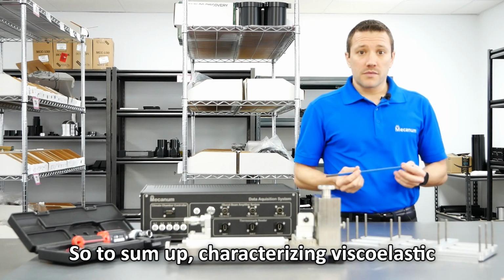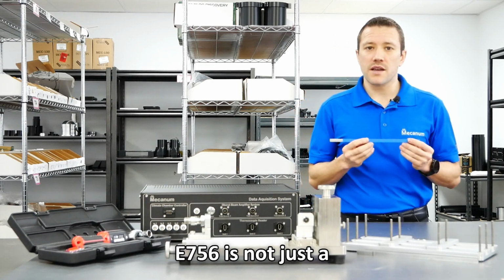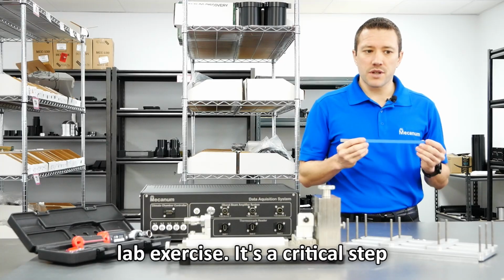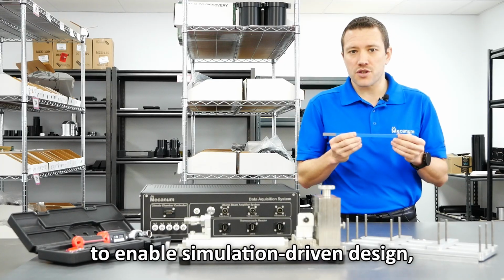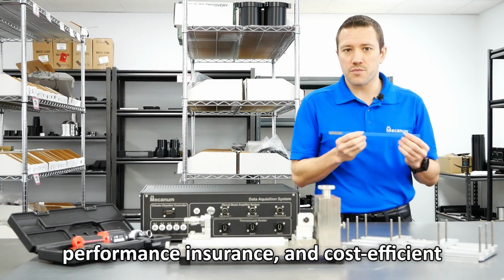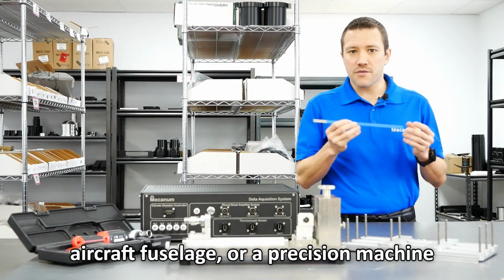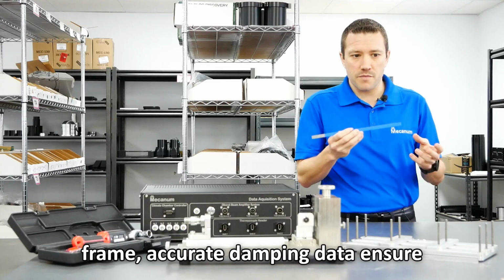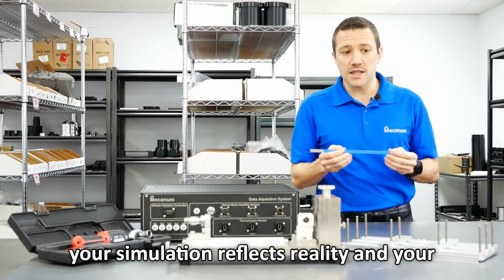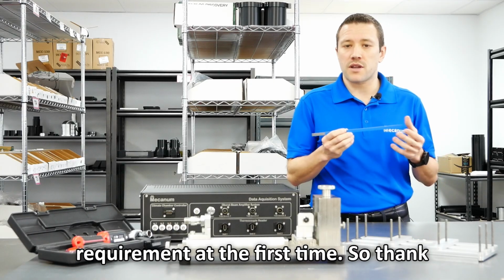So to sum up, characterizing viscoelastic properties using ASTM E756 is not just a lab exercise. It's a critical step to enable simulation-driven design, performance assurance, and cost-efficient product development. Whether you are engineering a vehicle dashboard, an aircraft fuselage, or a precision machine frame, accurate damping data ensures your simulation reflects reality and your product performance meets the requirements the first time.